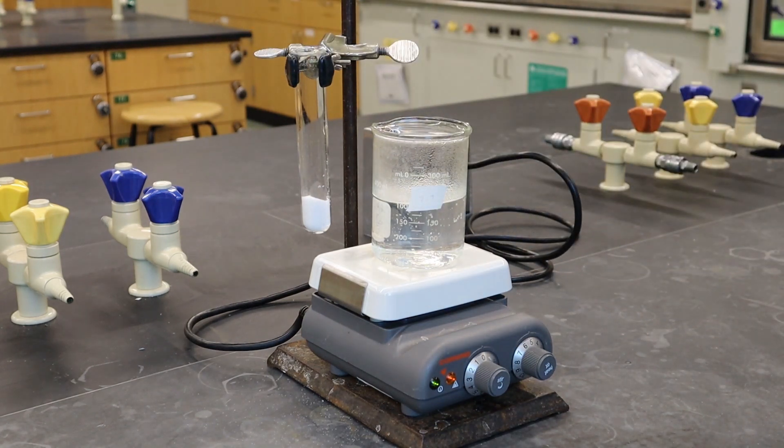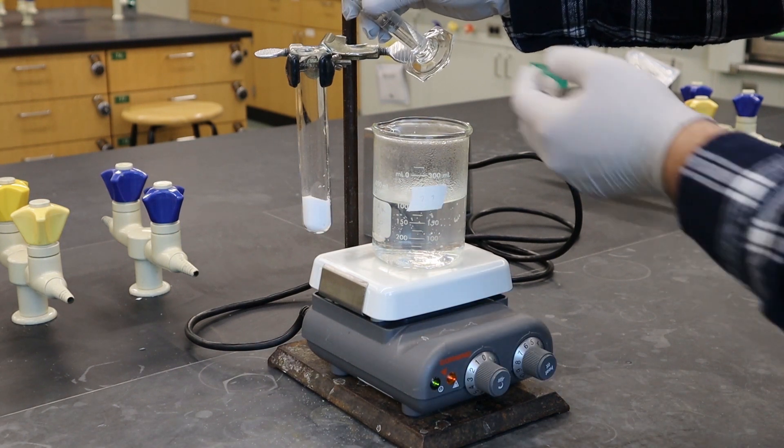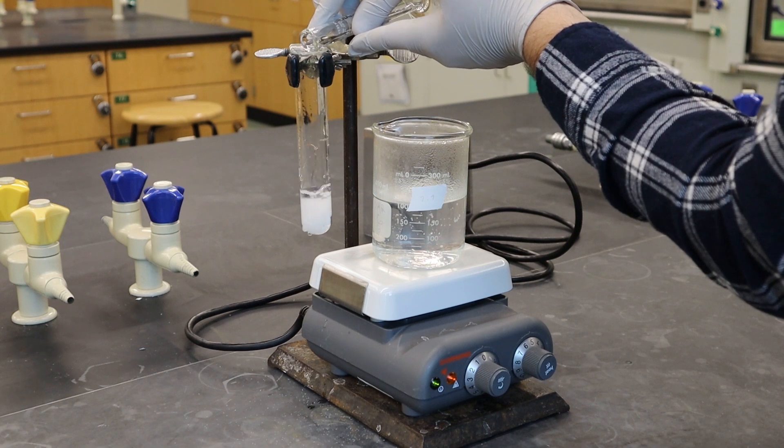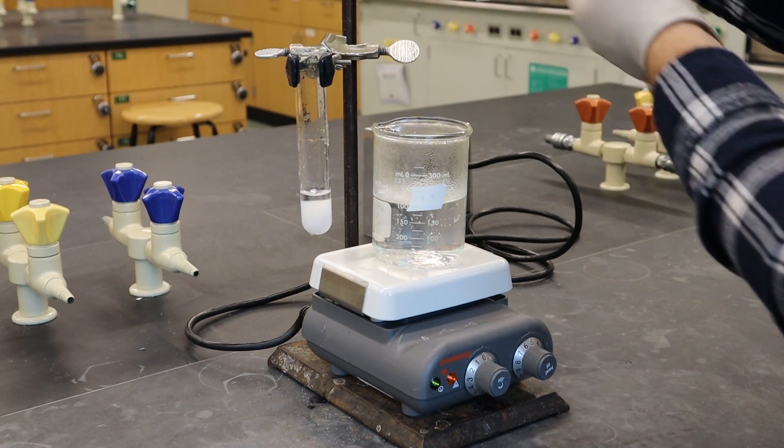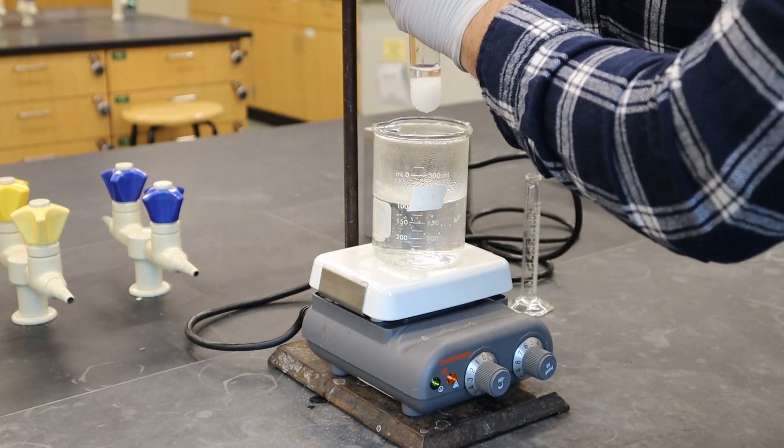And so in order to dissolve that much solid into your liquid it's gonna take some heating. So you add your solid in there, you add in your liquid, and then you stick it in the heat and the warm water bath to try and heat it up and get it all to dissolve.